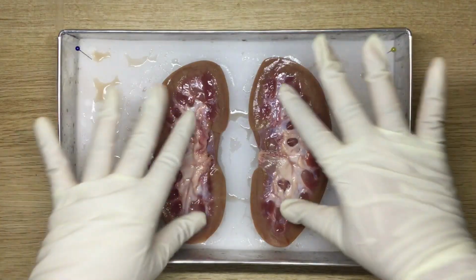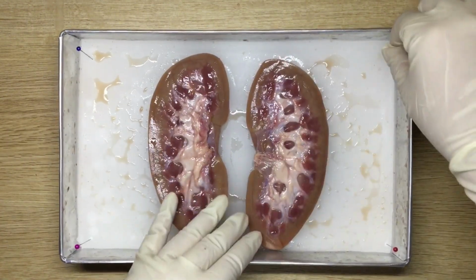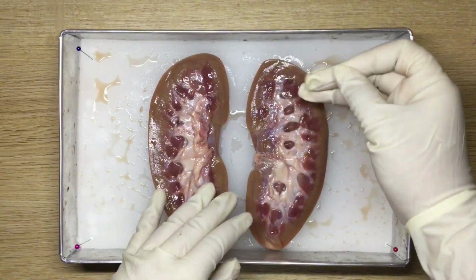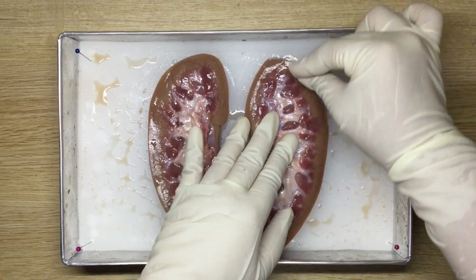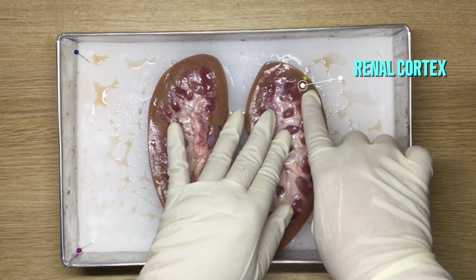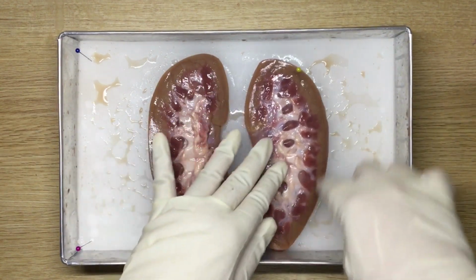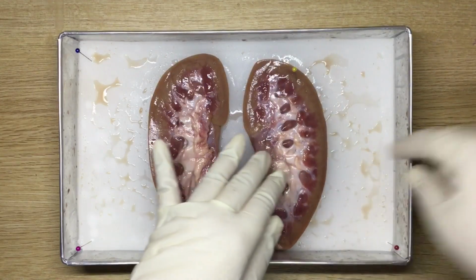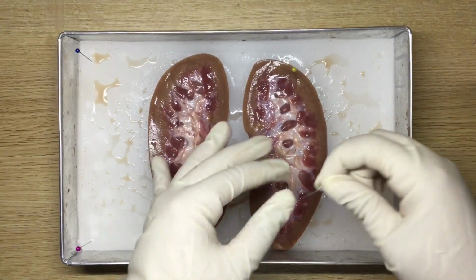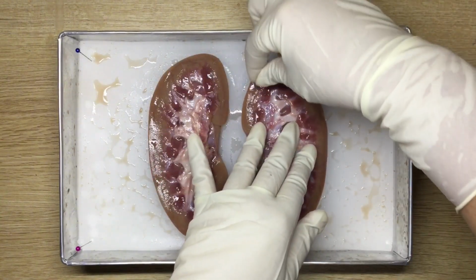Here, we will be seeing the inside of the kidney. We will use pins to discuss the functions that they have. This outer layer of the kidney, of a darkish brown color, we refer to as being the renal cortex, identified by the yellow pin. Moving inwards, each segment that you can see inside the kidney, we refer to as being a renal pyramid, identified by the red pin.